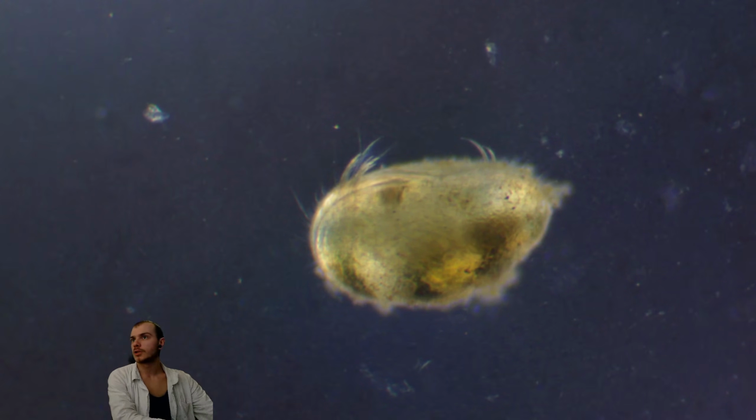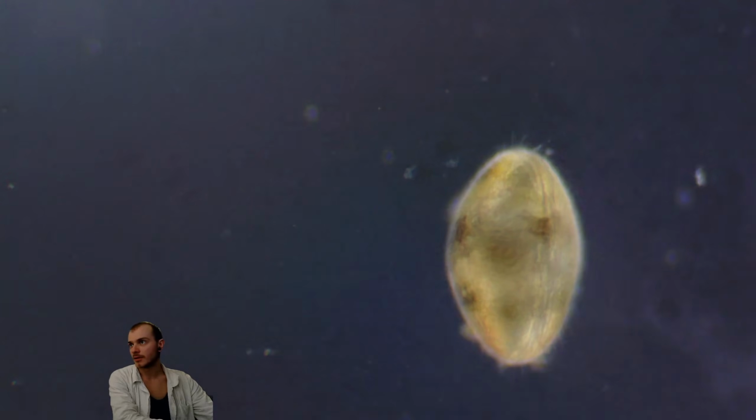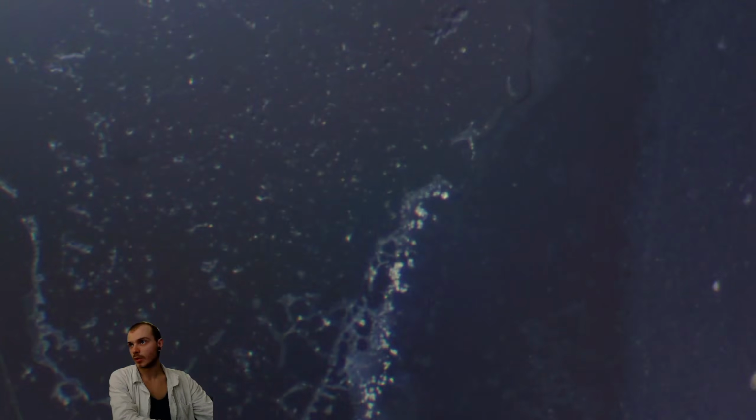Okay, so I'm just going to check it with a microscope because it is not seen cleanly by eye, as there is too much light from the light source. And if I turn off the light, I see nothing, so I'll just try to use the objectives only to map this.